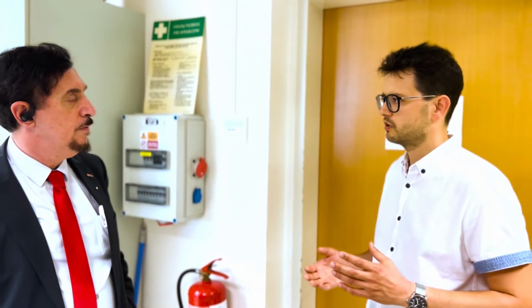If it is higher, what do you do? You come back here and change the process, change the conditions. We can do that actually, but in this specific case of food industry waste, it is not an issue because it is already coming from food components, so the amount of critical elements is low. On the other hand, other elements which are naturally present are important for the nutrition of the plants. So that is the reason why we analyze them.